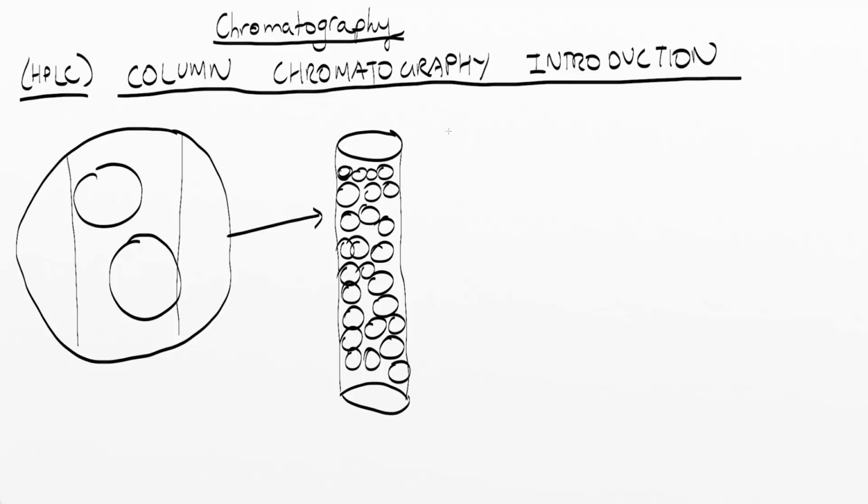Alright, how does column chromatography work? The way column chromatography works is that instead of having a plate as your stationary phase, what you have is little balls of solid alumina or silica that could be coated in a thick viscous liquid. Right, sometimes it's coated in a thick viscous liquid, sometimes it's not, but the idea is the same. It is solid alumina or silica. Okay, and this is packed into a column, as we can see here.